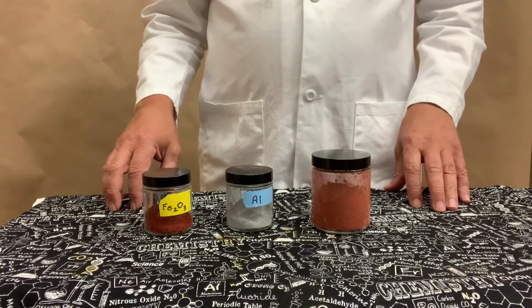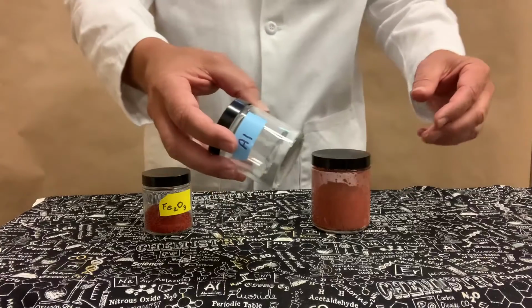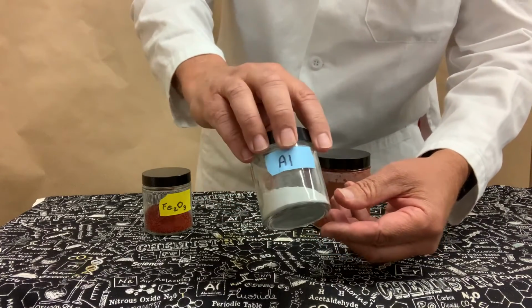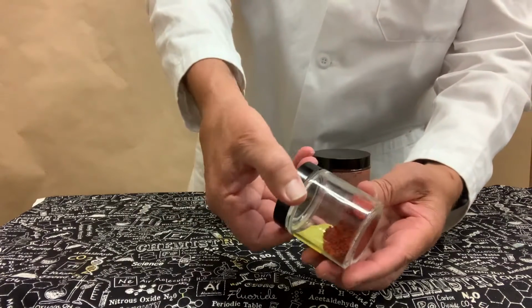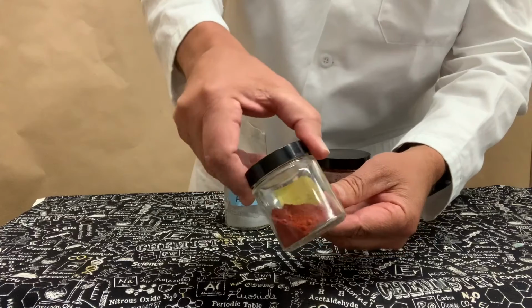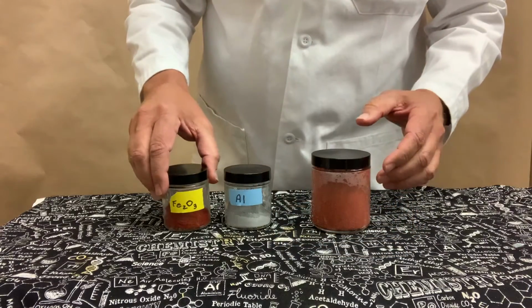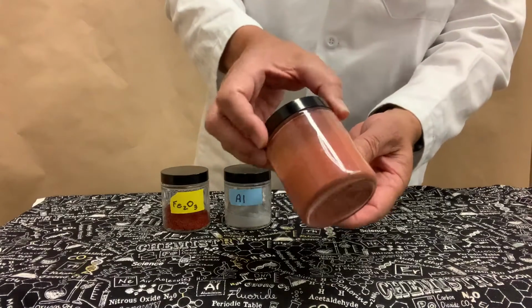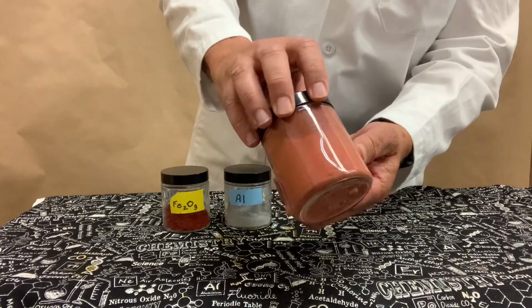In order to make the reaction happen, we have to mix together very finely divided aluminum powder. You can see that there. With very finely divided iron(III) oxide. I've mixed them together in stoichiometric quantities, and this is the thermite mixture that results.